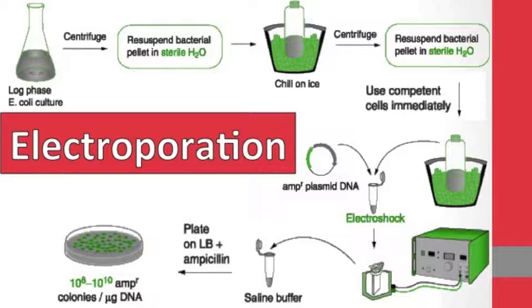The transformation of bacterial strains is done using a technique called electroporation. This process allows us to implant bacterial cells with the genes that will cause bioluminescence. For electroporation to work, bacterial cells must first be washed to remove polysaccharide layers around the cell wall. Cells also need to be concentrated to increase the efficiency of the process.